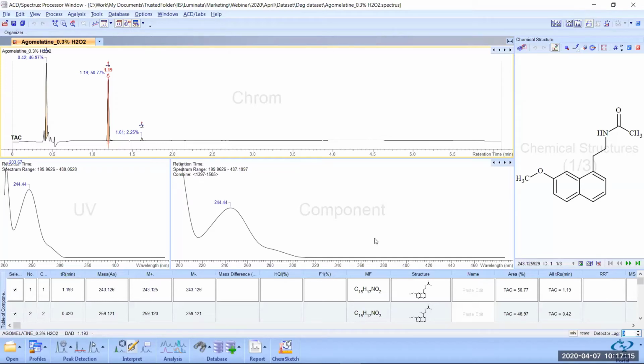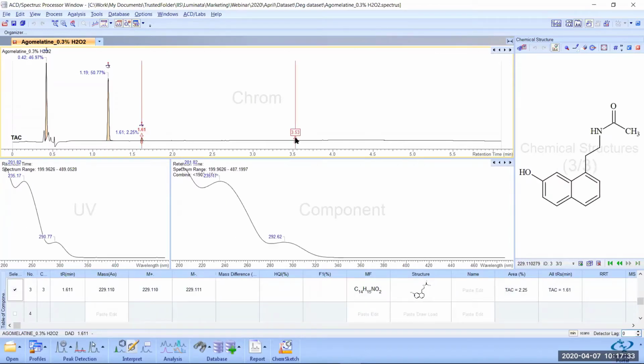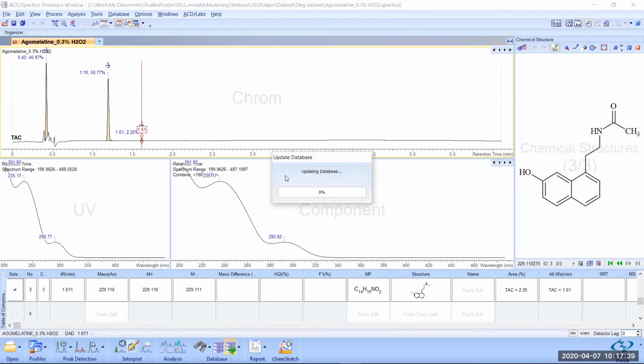So here we do have an Empower dataset. Within this Empower dataset, you can import the processed results, the validated results here. At that point, you can either import directly into Luminata, or in this case, what we've done is we just associated molecules. When we associate molecules here, we can assign it per peak. Once this is completed and you've done everything here, you can then just upload it within Luminata and choose the stage of interest.